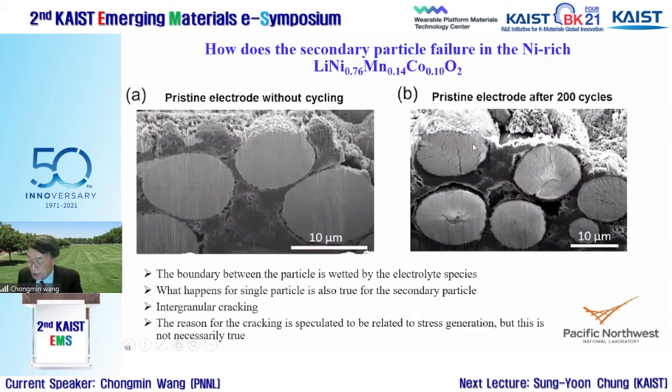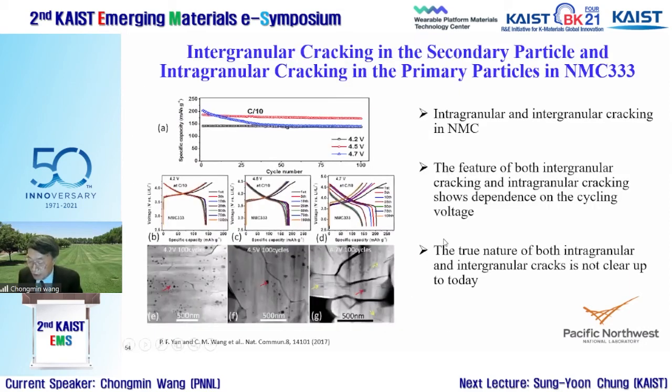At one level, I show you this intergranular cracking between the primary particles here. Another level of cracking you can see here with STEM imaging clearly shows what's going on. If you go to a relatively low voltage, 4.2 V, you can see smaller intergranular cracking, and there is no intragranular cracking, meaning no cracking within the grain. If you go to 4.5 V, you can see the gap between the primary particles is a little bit larger.